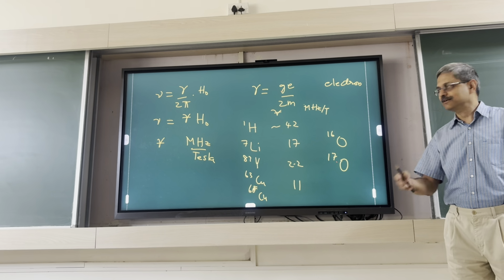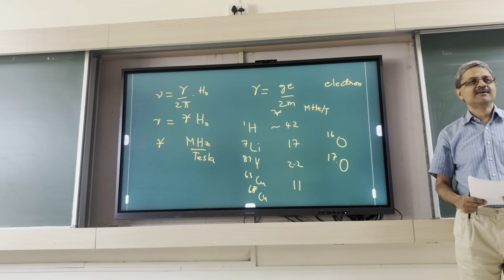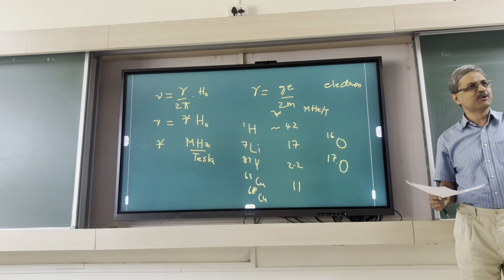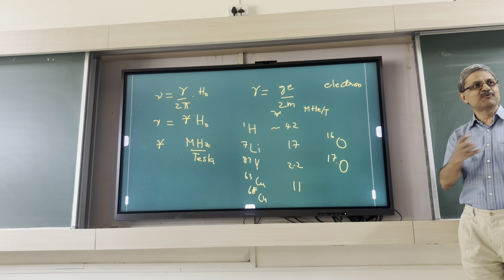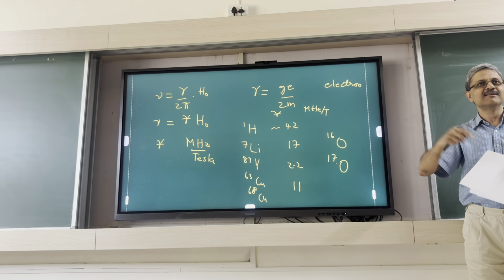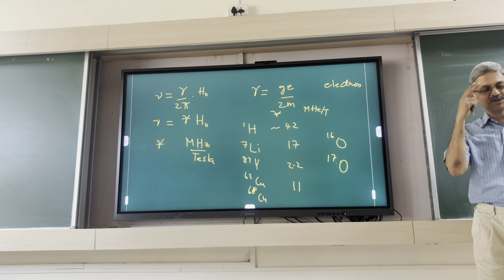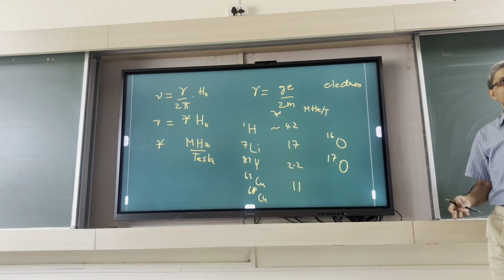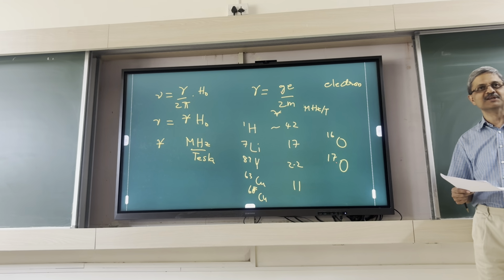So in comparison, if you take a huge cylinder, you have seen in the departments, big cylinders lying around, that typically costs 5,000, 6,000 rupees, something like that, good high purity. Compare that with oxygen 17, this tiny one, it's called a lecture bottle, because it's tiny, about this size. In terms of volume it may be 1/20th, 1/50th of the big one. It costs several thousands of euros, dollars, so lakhs of rupees.